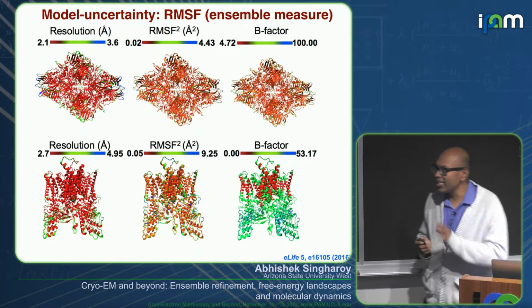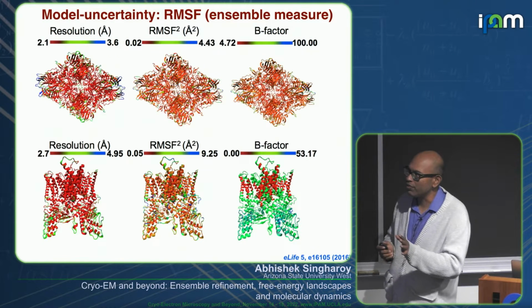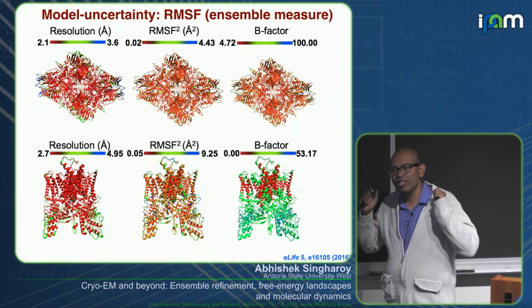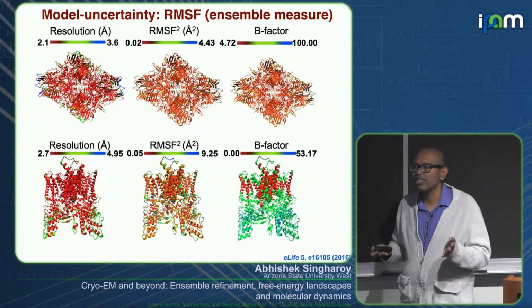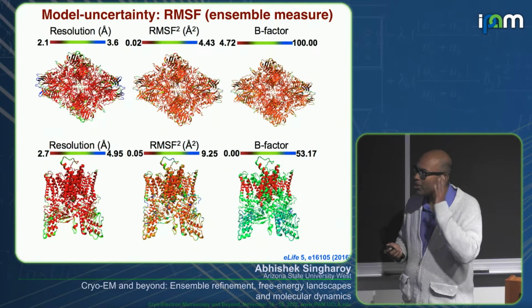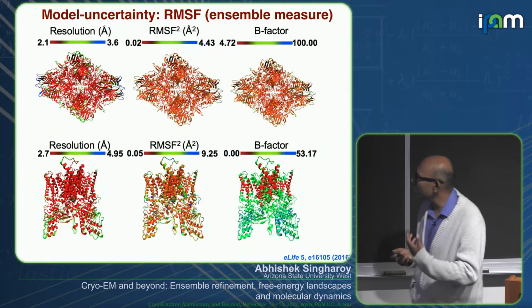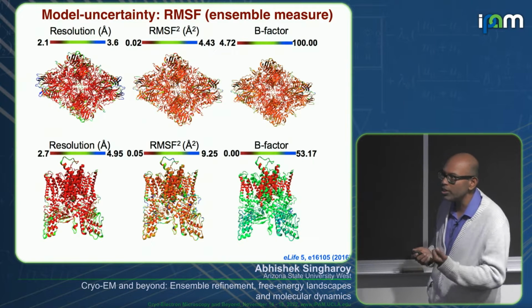One thing that we started realizing then was that there is a statistical significance to these kinds of simulations. Normally, molecular dynamics is used like a fitting tool. Essentially, you have a function, you fit to it. There is no statistical significance to it. There is no meaning to the deviations of that fit. You just fit. But we gradually started realizing that there might be some sort of an ensemble significance to this problem.